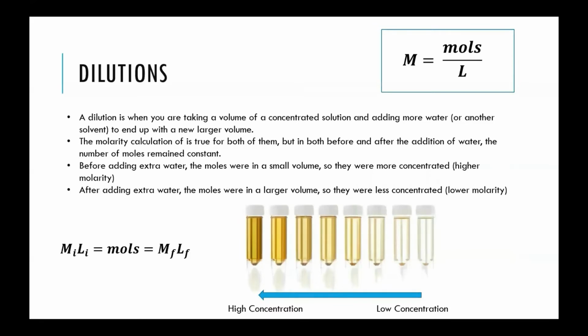The other thing for the next graph, preparing calibration graphs, is used with dilutions. Based on this image, you can see a low concentration is very light, a high concentration is very dark. So we're looking at how the light interacts. It is interacting more with this concentrated sample and less with the lower concentration sample.